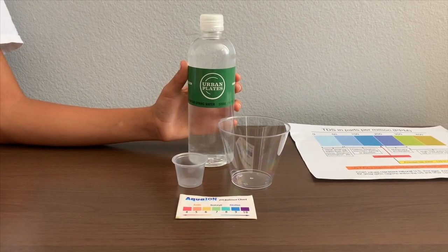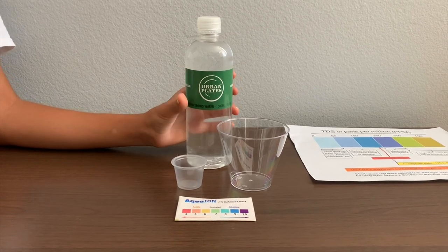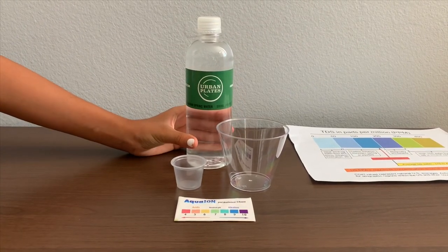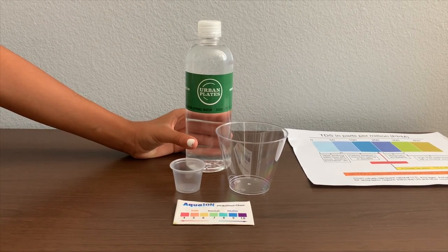This is Urban Plates Mountain Spring Water from Palomar Mountain, California. It costs $1.99 and it says its pH is supposed to be 7.3. Let's test the TDS and pH levels.